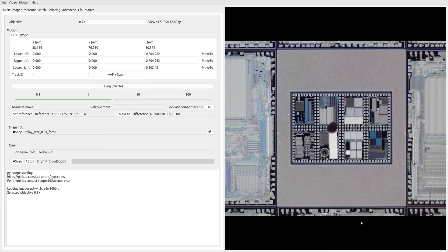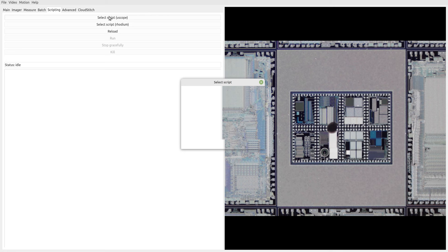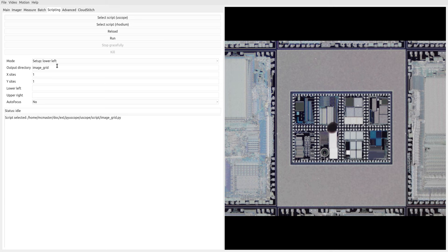We're going to do this by using the scripting capability built into the software. First thing we need to do is go over to scripting and say select script. In this case, I've already written a script, so we're going to use that. And the way that this works at a high level is it has three kind of modes it operates in.